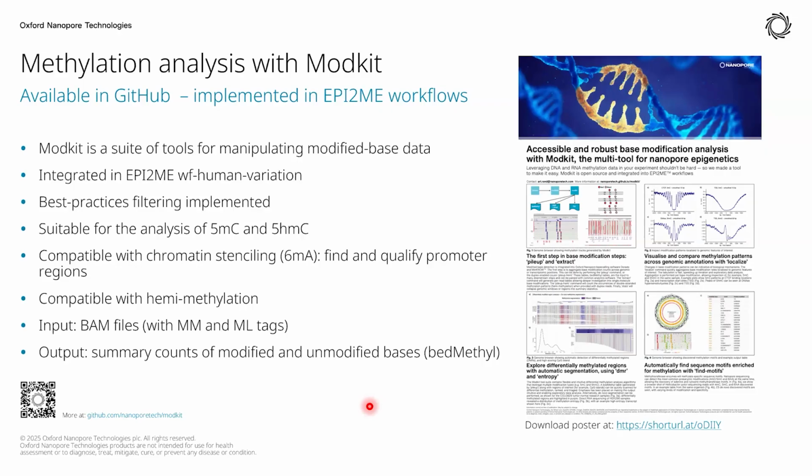But the software and the analyses also work with all of our other modified base calling models, whether you're looking at RNA mods like inosine or pseudouridine. Yeah, it would all work for those as well.